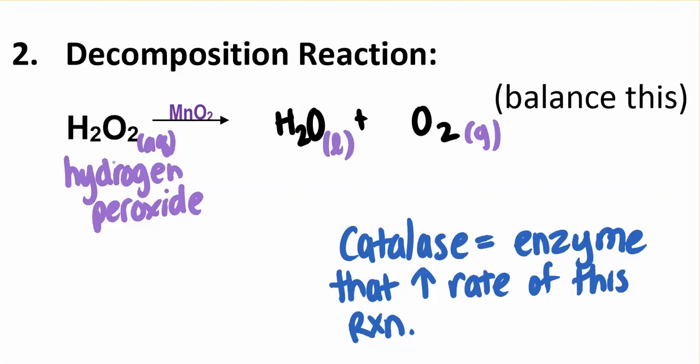That's how it's used as a disinfectant. It will damage the cell membranes and proteins of the bacteria. In fact, we even have white blood cells that produce hydrogen peroxide and kind of shoot it out at bacteria. But anyway, so this reaction happens in your body. This is a catalyst up here that you will use, manganese dioxide. On this one, I'm just going to balance it.